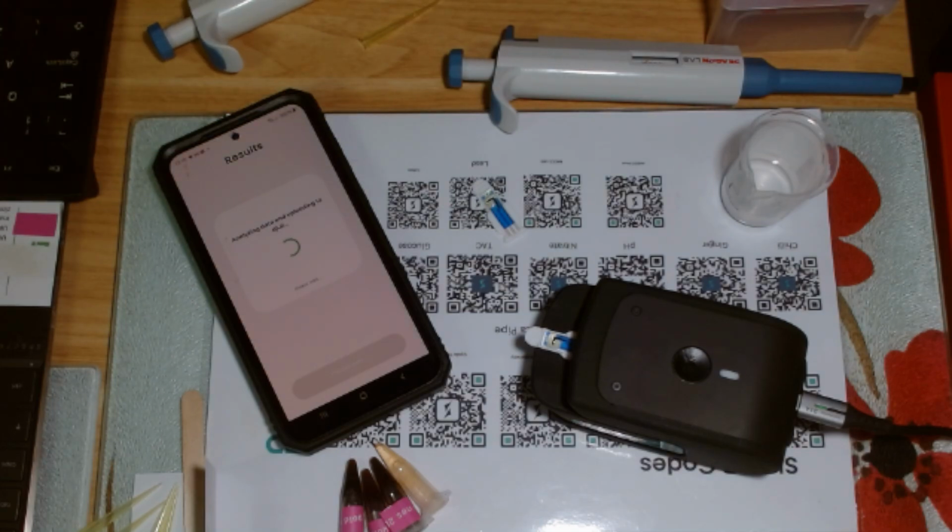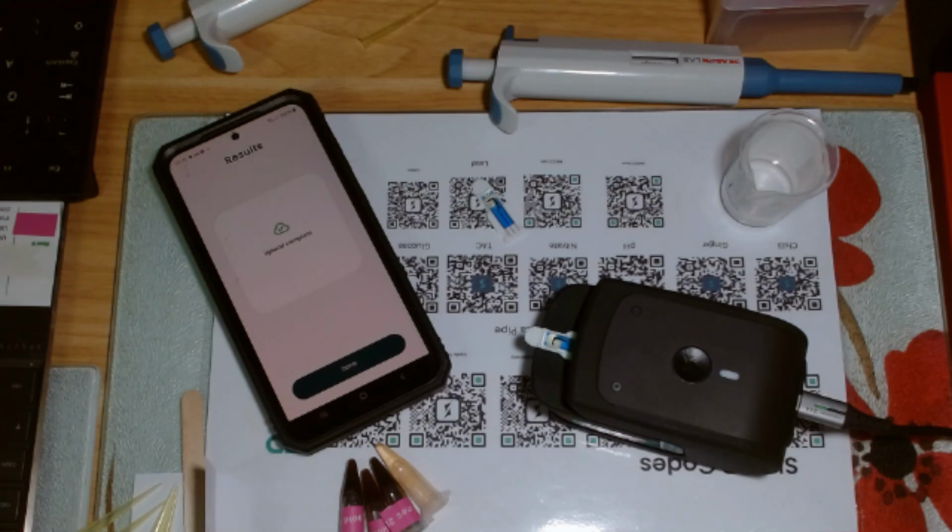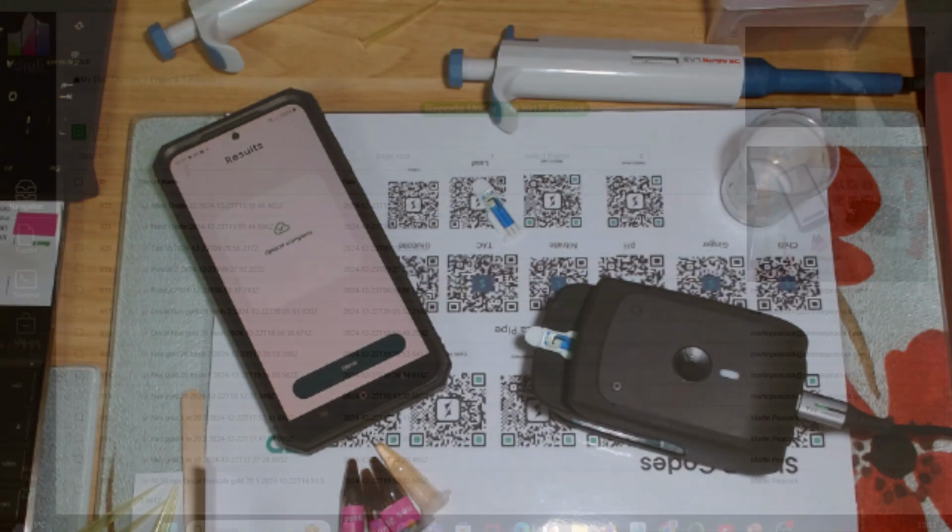But what I'm describing here is, how do I put this, a scientific experiment, a scientific proof of principle. It's not a clinical experiment where one is able to make clinical claims without some kind of investment of effort. You can put clinical samples on it, but I don't want to make out that this is a clinical instrument.